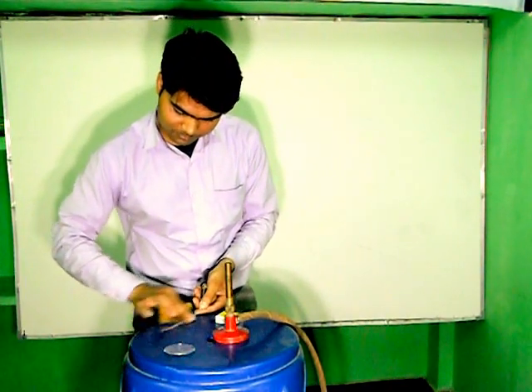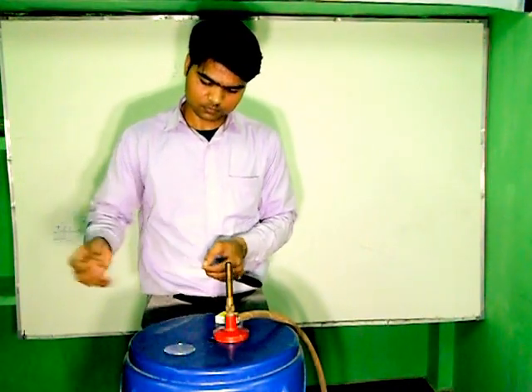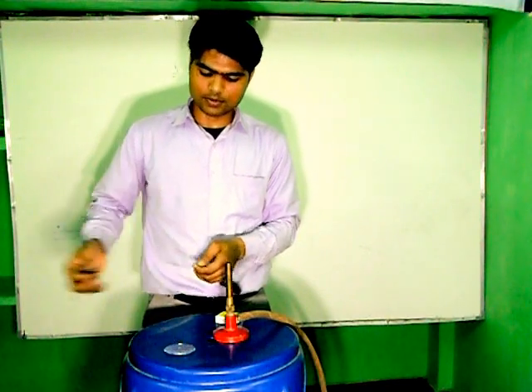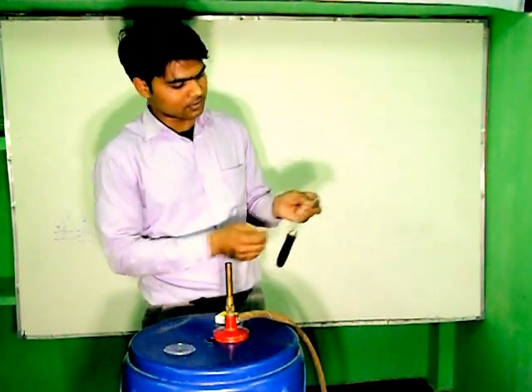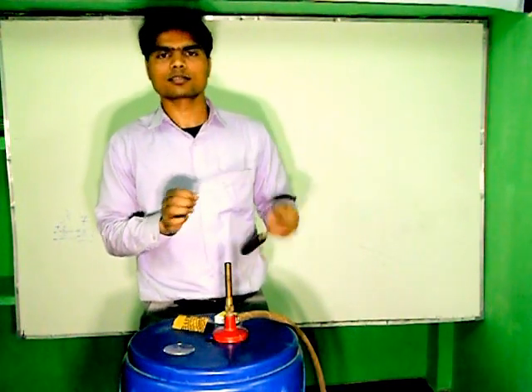Let's start. Here I have rubbing with the help of Sandpaper. Now you can see the Sandpaper remove all the Oxides of the Magnesium Riven. And now it is shining.